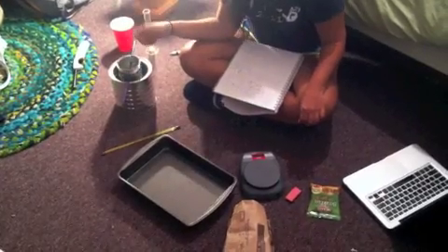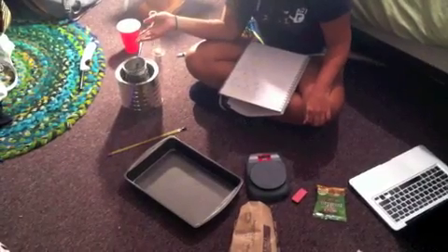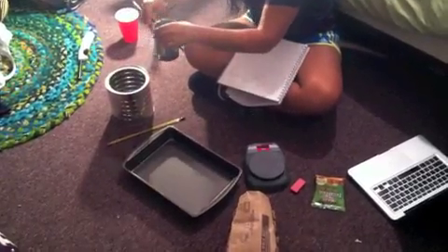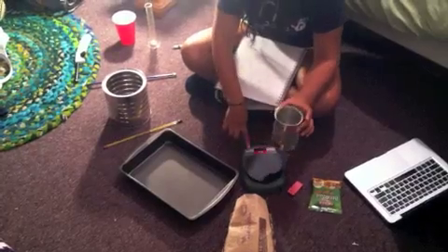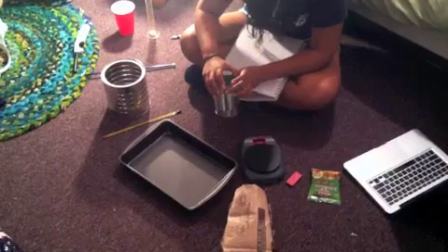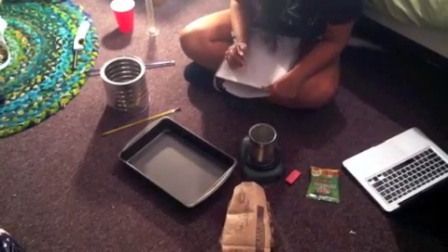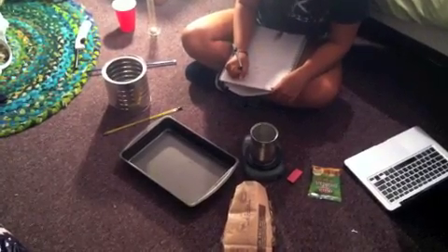We're going to measure the water's temperature before and after the item is burned. To start, I'm going to take the small can, turn on the scale, and measure it. It reads 67 grams — we're measuring in grams.